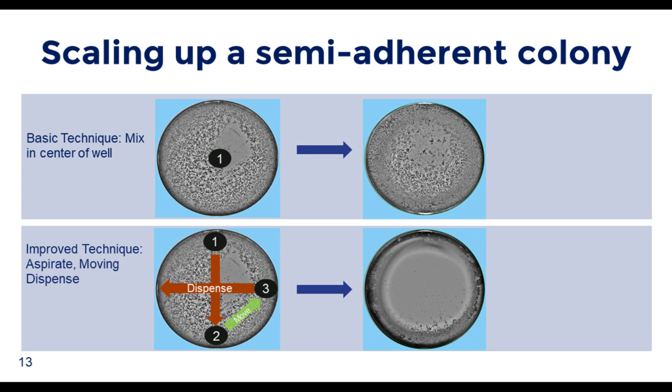Another lesson learned during the process was that we did not need to tilt the plate as we do in our manual workflow to aspirate sufficient volume from the well. Performing the final aspiration close to the edge and bottom of the well was sufficient.